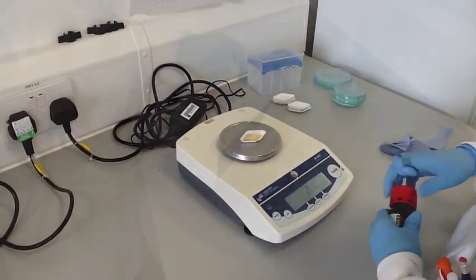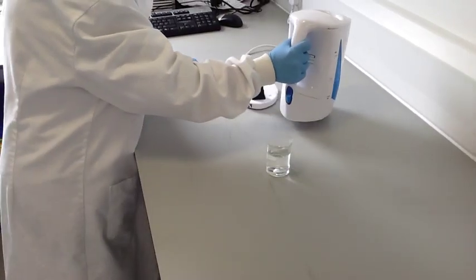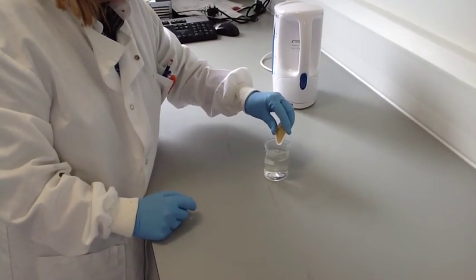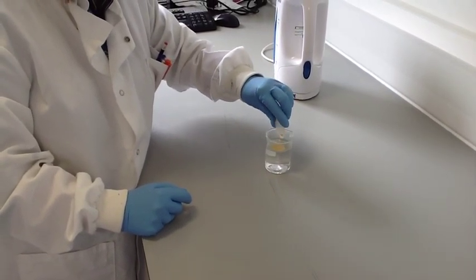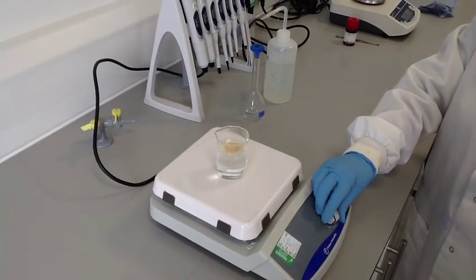Warm up approximately 75ml of distilled water — we used a kettle to heat until not quite boiling. You need to sprinkle the alginate into the warmed water because if you add it too quickly, it can clump together and take longer to dissolve. Then, if you have a magnetic stirrer, set this up and leave it to dissolve for about half an hour.